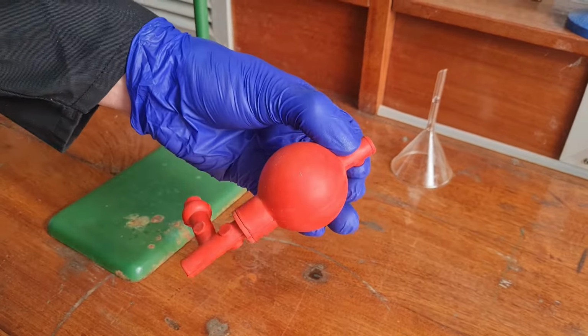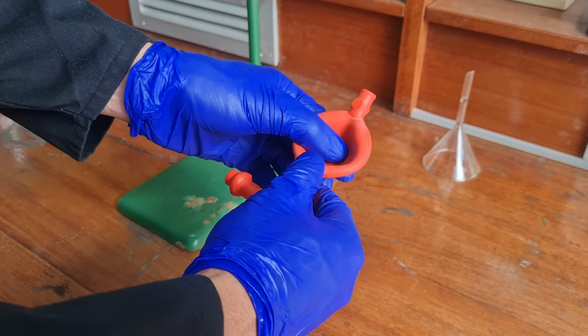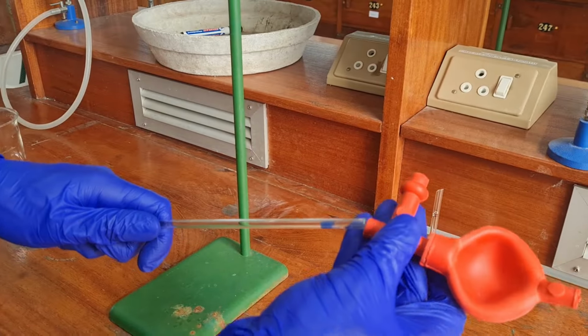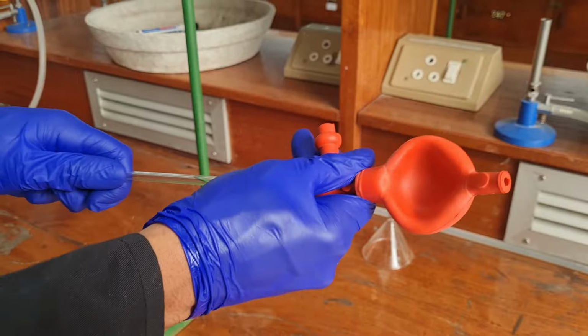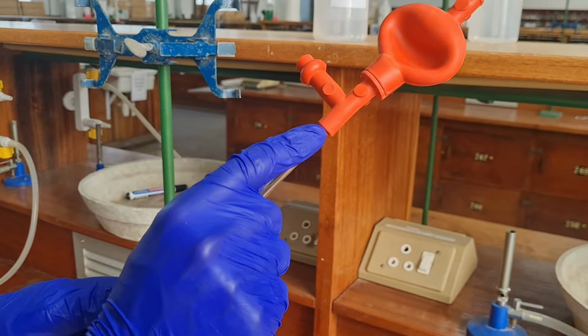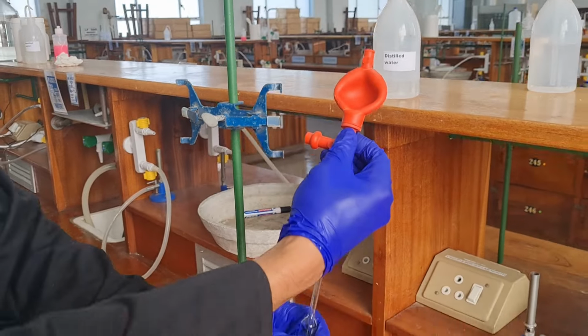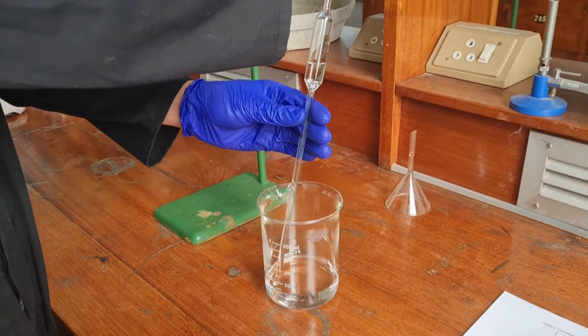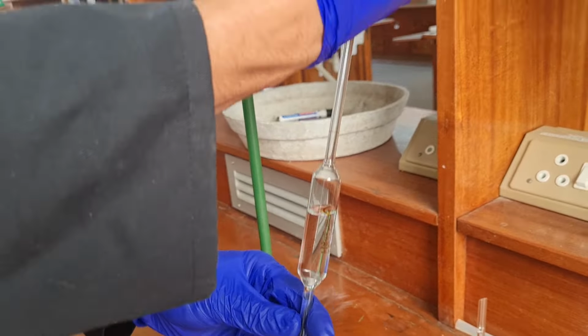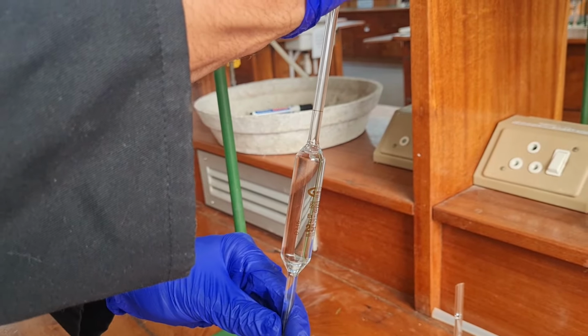Making measurements with the pipette. Read the instructions for the use of a pipette and rinse a 25 cubic centimeter pipette as described to prepare it for use. Fill the pipette with unknown solvent to the 25 cubic centimeter calibration line marked on the pipette using a pipette filler bulb and let the solvent drain into the same dry glass beakers from the previous measurements.